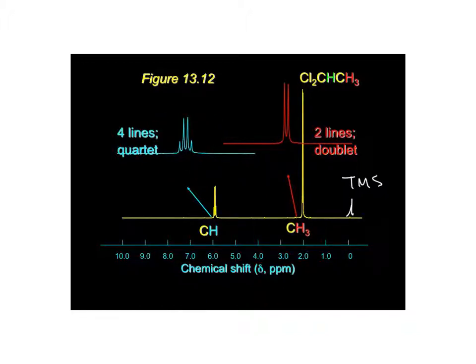So we have singlets, doublets, triplets, quartets. I've heard some people say quintet, but some people say pentet for 5, and then hextet, and so on and so forth. So if you didn't know anything else, this would look like how does 3 hydrogens give off 2 peaks, whereas 1 hydrogen splits into 4.